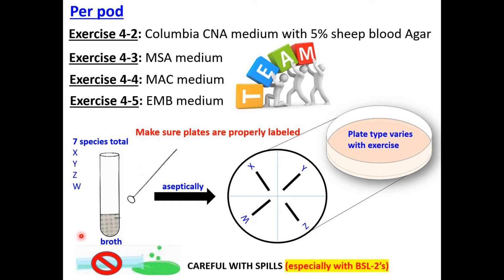Okay, and we would do this from a broth. So we would have to be careful because of the spills when we do this. But usually this is done very quick because the only thing we do is a straight line. It's not even like a zigzag, and that makes it much easier. So we already had enough experience so far to know what it means to streak a plate. So I'm not concerned that you guys wouldn't know how to do this.